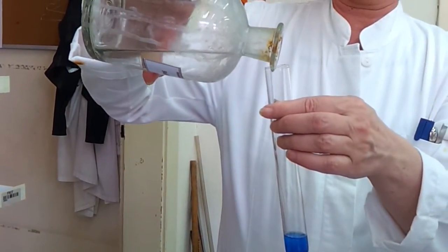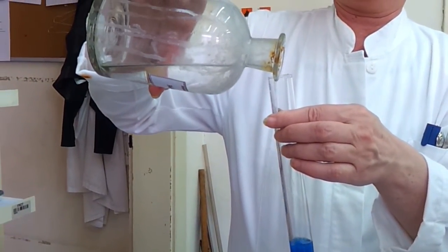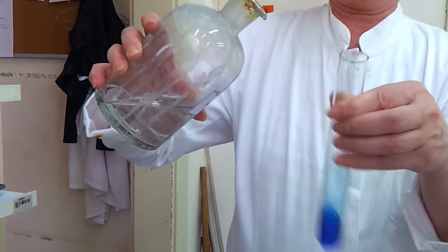Then we have to add an equal amount of Fehling's 2 solution and 0.2 mg of sugar.